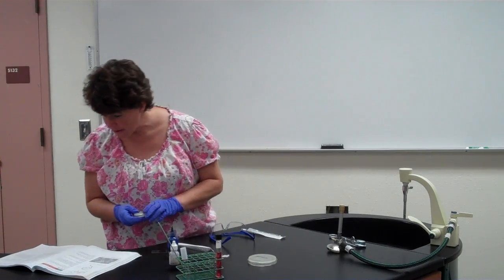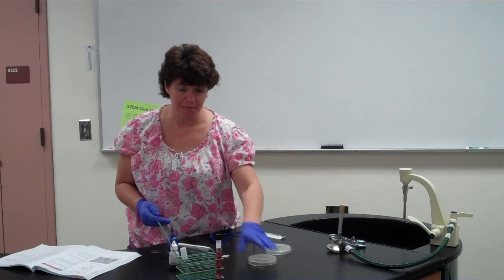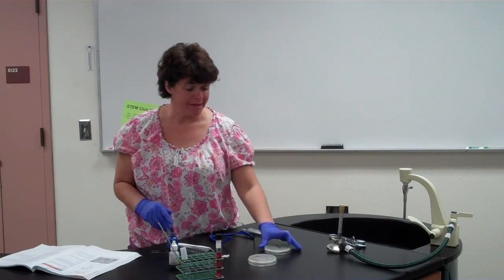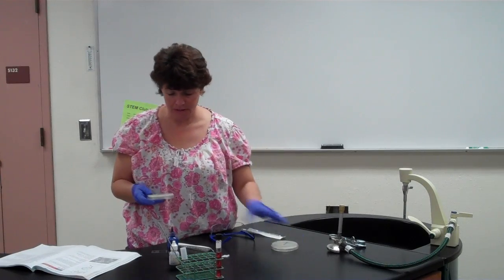The next thing that you're going to do is you're going to have 2 plates of an agar called glucose acetate. It's a special agar that helps them grow and reproduce, and if they produce spores, you'll notice the difference. And you have 2 plates because you have 5 cultures. Basically, you take one plate and divide it into thirds, and you take the other plate and divide it into half. So you'll put 2 species on this plate and 3 species on this plate.